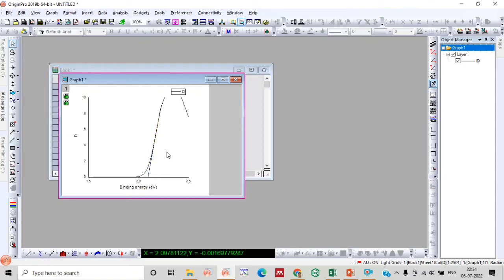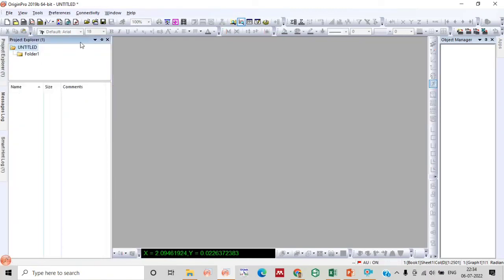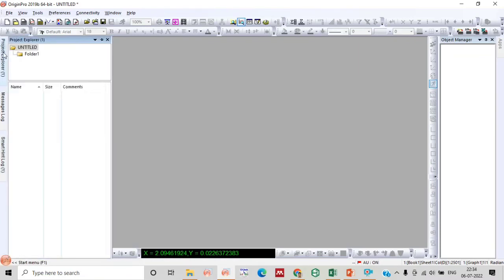The intersecting point will give you the bandgap value, which is 2.09 eV. And in this way you can calculate the bandgap by using a Tauc plot. So thank you friends for watching my video.